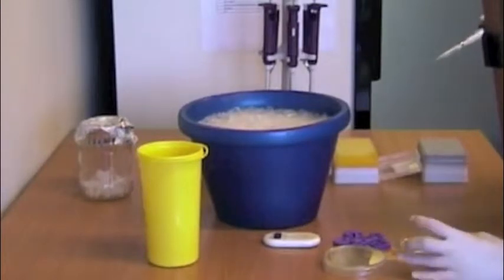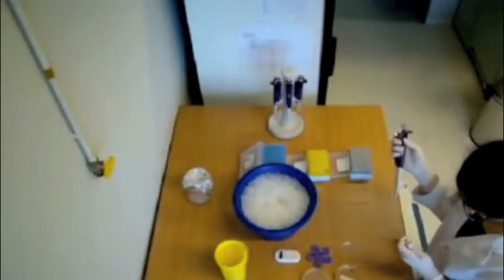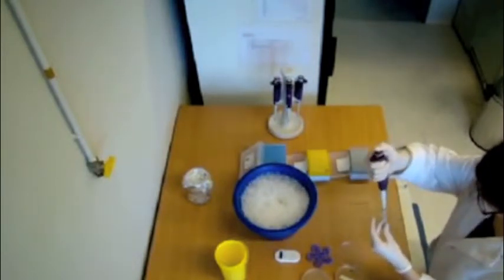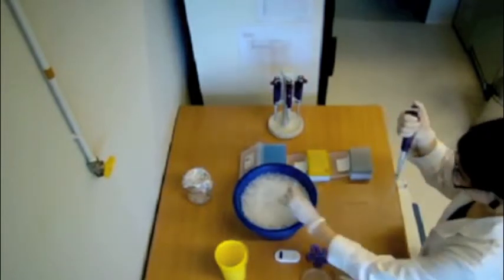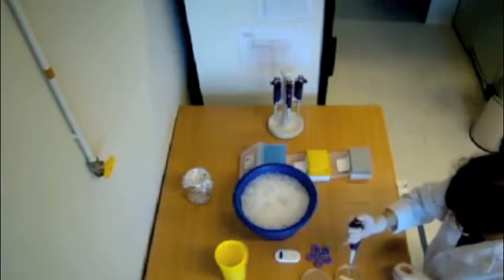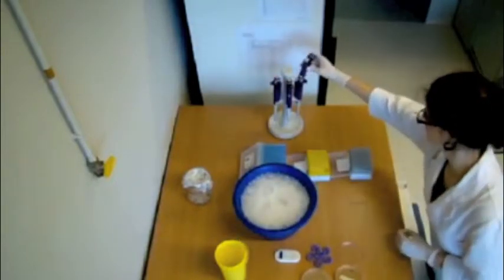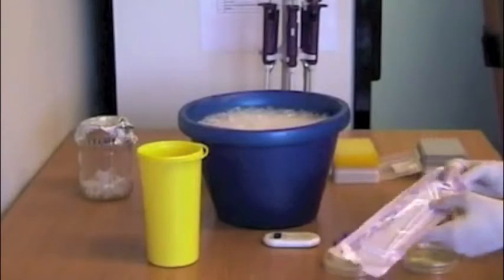Take out the cells in SOC from the shaker. Plate 20 microliters and 200 microliters of bacterial solution on the dishes and spread them with a plastic rod. This enables you to pick up a single colony.